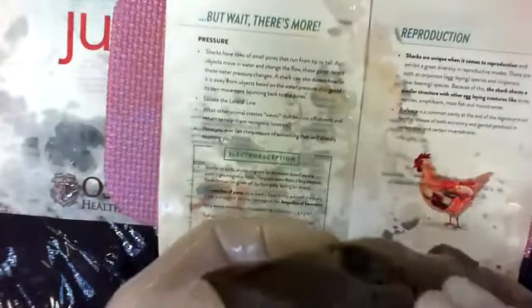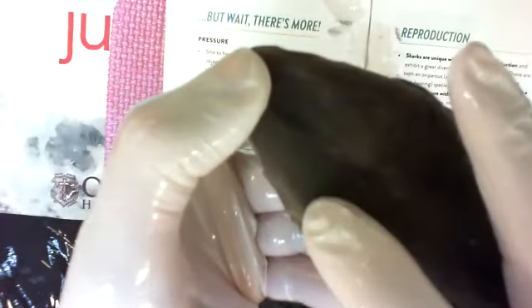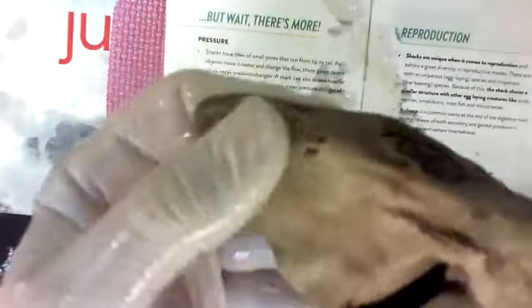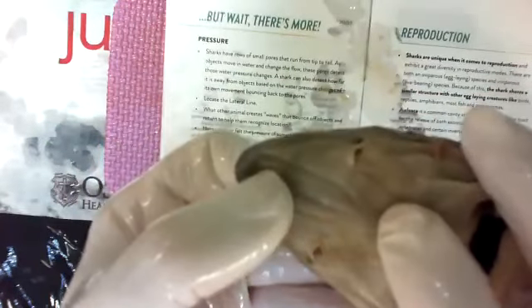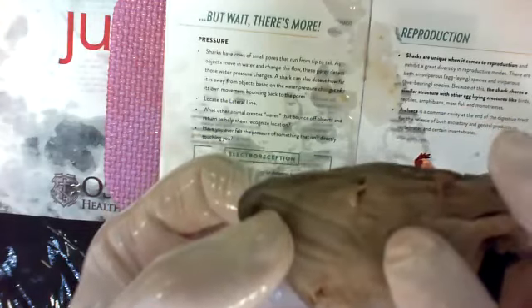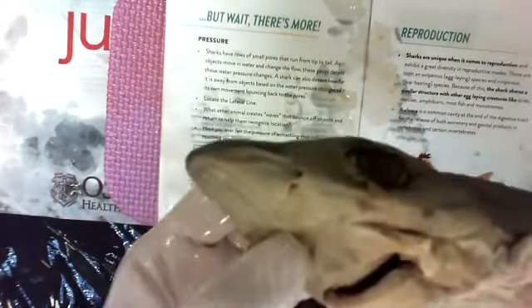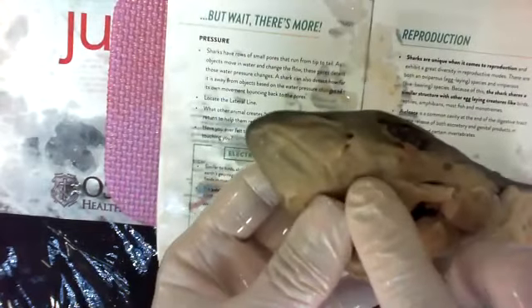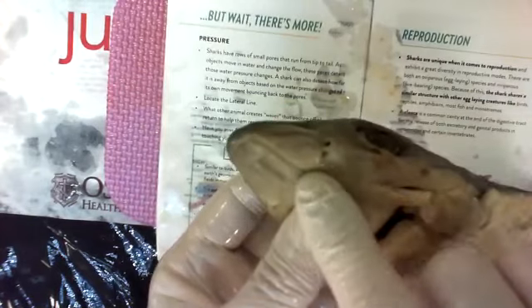Electroreception's the last. This is probably the coolest though. So I don't know if you can see all these little tiny pores. Not the 2 up here that we were talking about, but all kinds of little pores out there. Can you see them on your fish? Lots of little tiny holes. Those holes are also organs. They're called the ampullae of Lorenzini, and they're filled with a gel. So a gel that doesn't dissolve in the water.